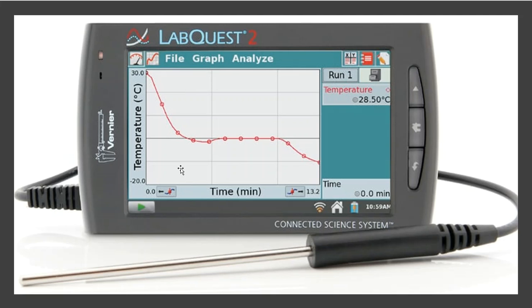This is not what the pH screen looks like. This is just a stock image of the LabQuest 2 device. When you plug in your pH probe, you will see just a green screen, and it will say pH equals, and then it will give you just a big fat number right there in the front of the screen. That's all that you have to write down.